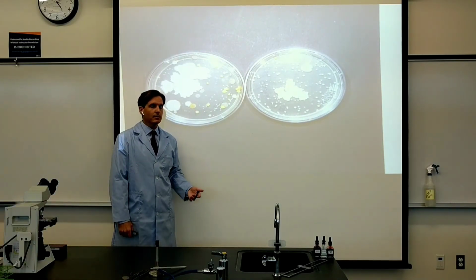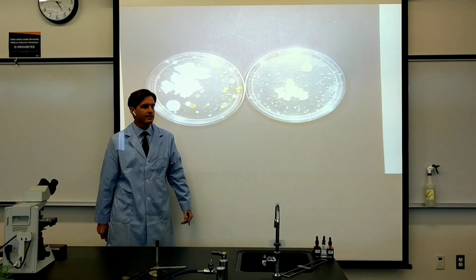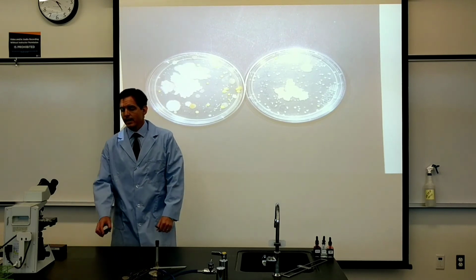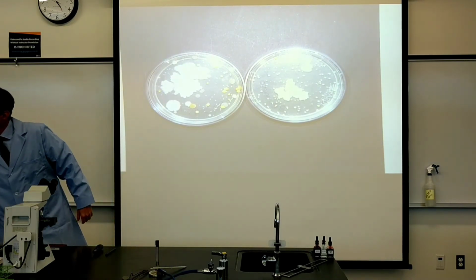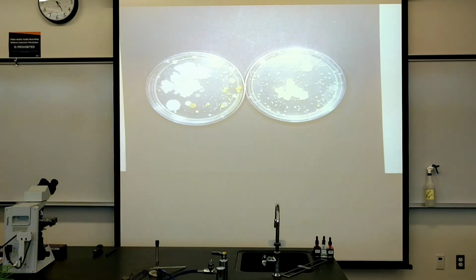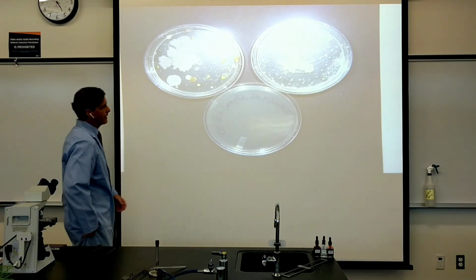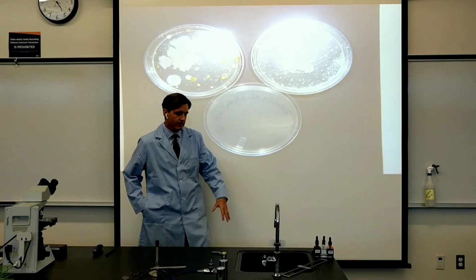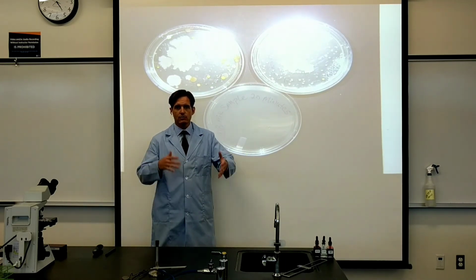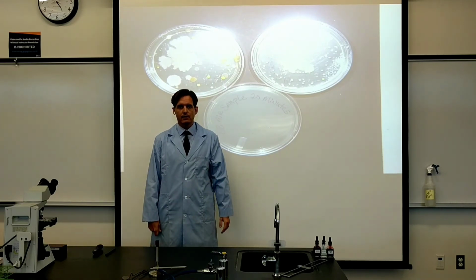Just looking back at them, they're more mature. They've had a chance to grow at room temperature for the last 5 days outside the incubator, and I think that's as much mileage as we're going to get. And I say that because our air sample grew nothing, and that is unusual. I think the micro lab has just been undisturbed for quite a while, and they had actually redone the floors so that they're nice and shiny and they don't have much dirt on them, and there just wasn't much flying through the air. And so our air sample just didn't show anything.